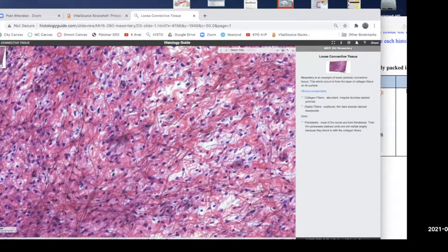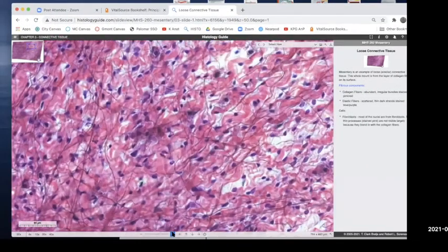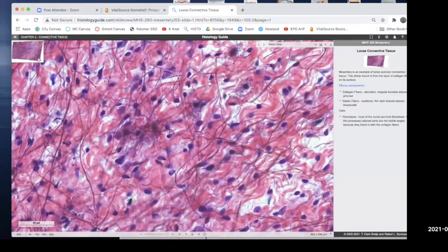So when I ask you what the tissue is, the wrong answer is mesentery. The tissue is loose connective tissue. And this picture looks almost just like your cartoon pictures that you have in your book. You've got all these purple dots right over here. For our purposes, I'm going to show you exactly this picture on the practical.